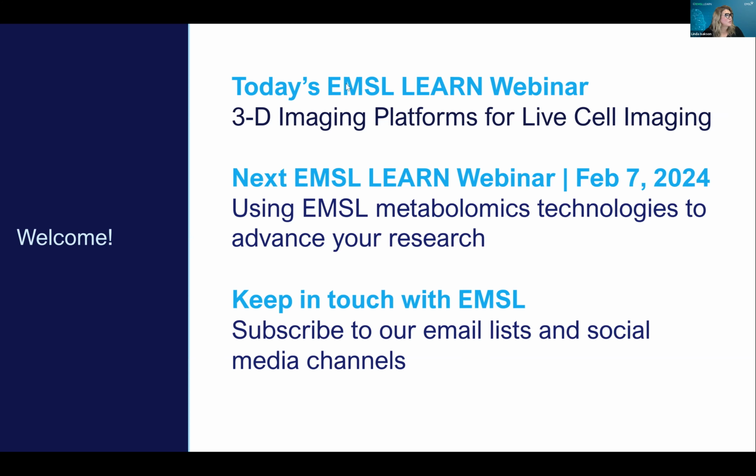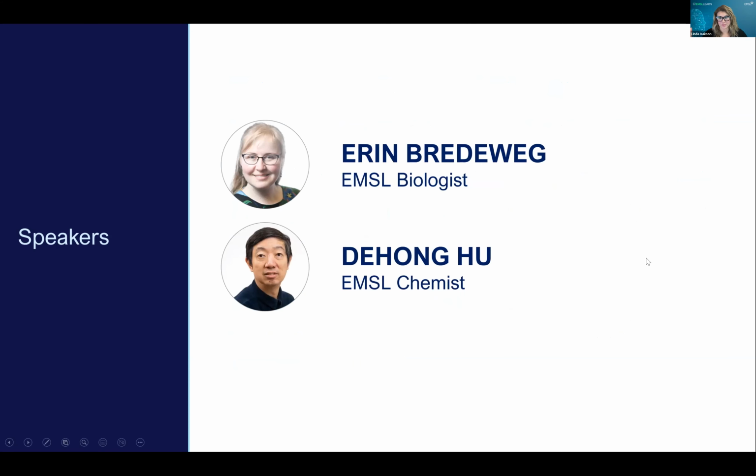So for today, as a speaker, EMSL offers access to live cell imaging platforms for your biological research. And today, you're going to hear from EMSL biologist Erin Bredeweg as she talks through EMSL's latest platform called NanoLive. And you'll also hear from Dehong as he discusses EMSL's Lattice light sheet capability for 3D imaging.